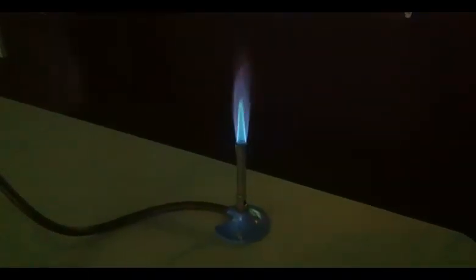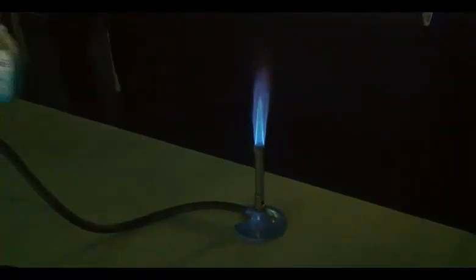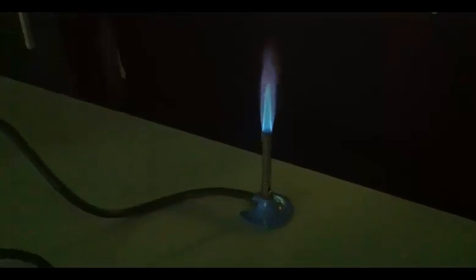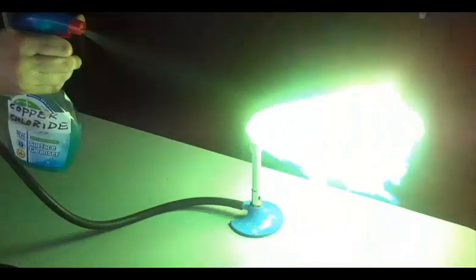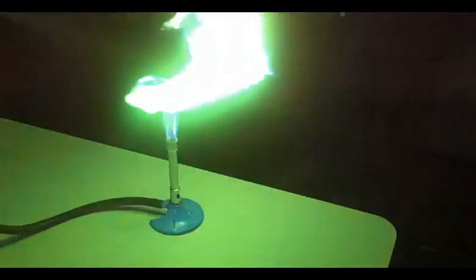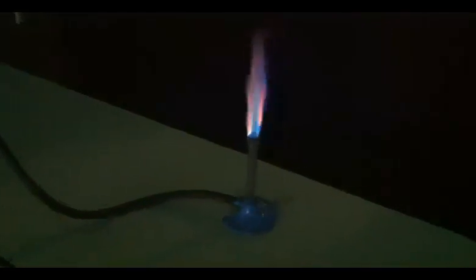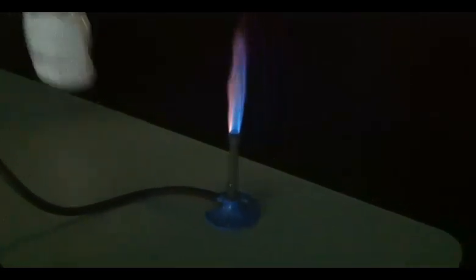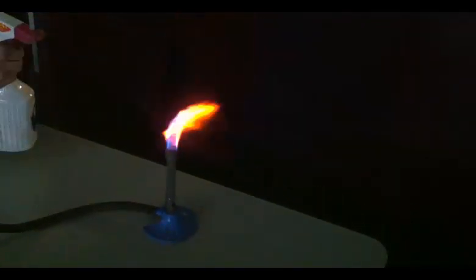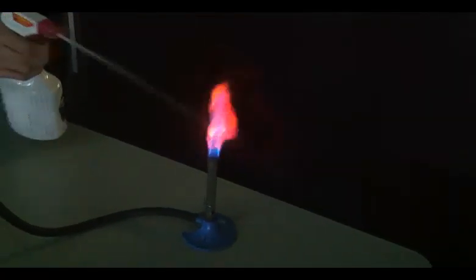Right, shall I do copper first? Just look at the flame. Right, no flash, because you won't see it. Right, copper chloride. Wow. Okay, produces a blue-green flame. That was really nice. Wonderful. That was copper chloride. Next one. Lithium. Wonderful. Look at that beautiful red colour.